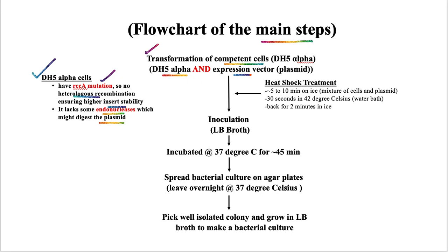the next step is to do the transformation. So how do we do this transformation? It is basically done by a simple treatment. We call that heat shock treatment.